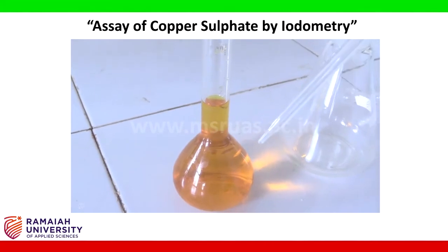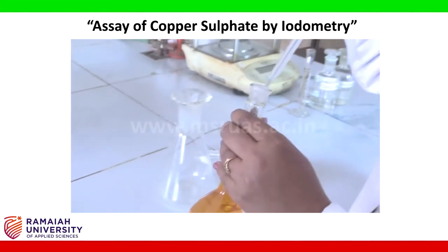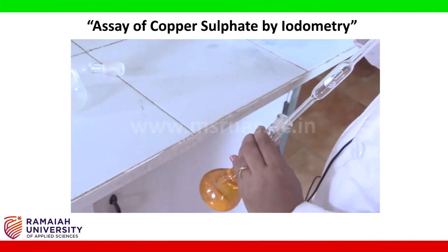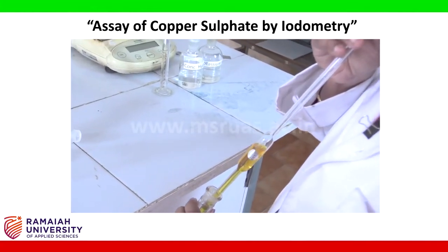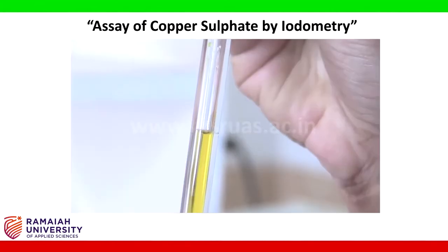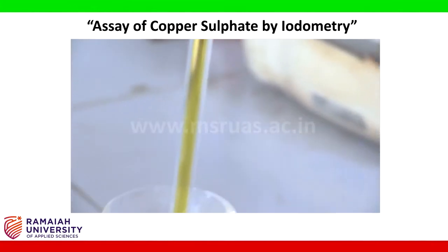Transfer 10 ml of potassium dichromate solution into 250 ml iodine flask.